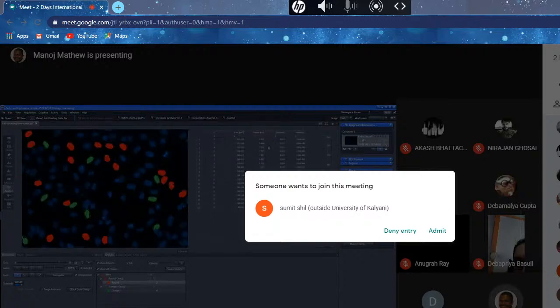Let's look at our measurements. See, all these measurements are done automatically. And I can have this group measurement. So in this frame, I have 18 cells. This is the total area of all the cells. This is the area percentage. Let me show one class at a time. The red objects, or the round objects, are occupying, let's say, 3% of the total area of the frame. And this is the mean intensity of all these detected objects.